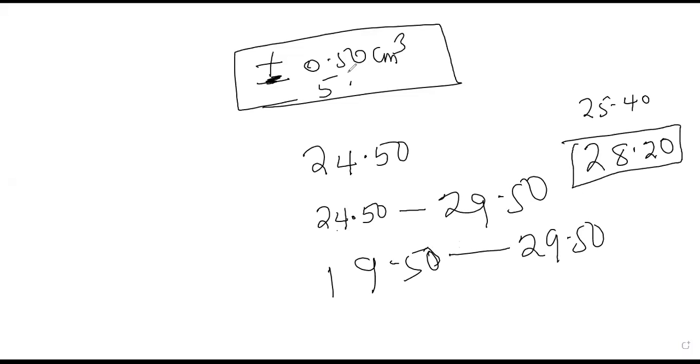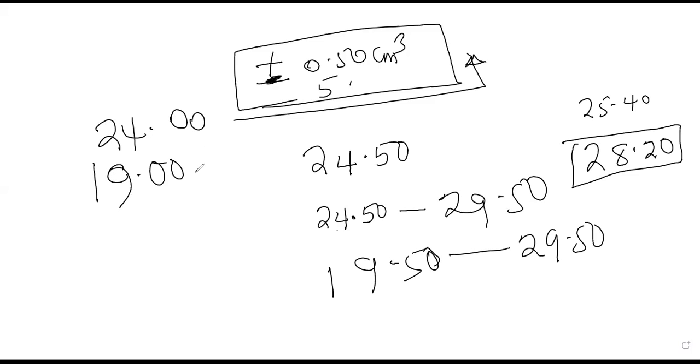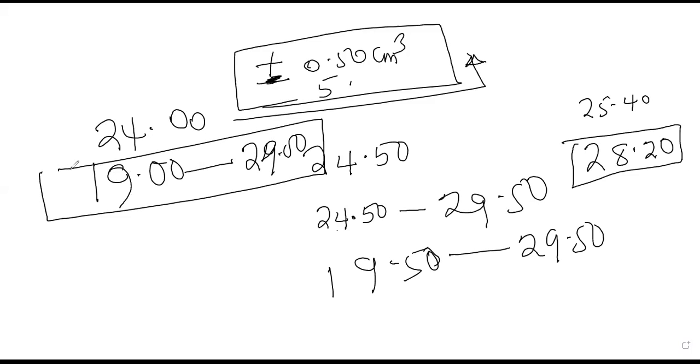Do you record the average to 2 decimal places? Yes. Anything you've gotten from the table, do to 2 decimal places. Here, they mind about the accuracy based on the value someone has added. If the teacher's value was 24.0, it means all students who have recorded from 19.00 up to 29.00, their table will be correct. Table, not average. They'll give you all marks for the table. But when it comes to the average now, the accuracy reduces to plus or minus 0.5.